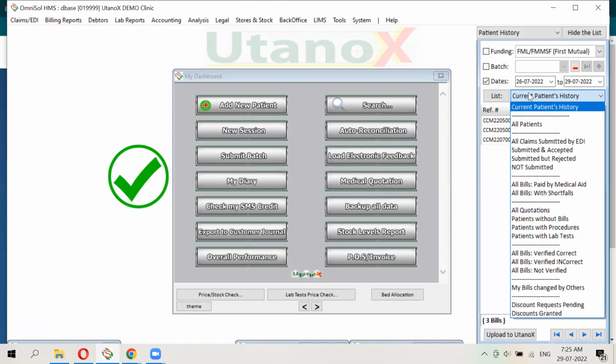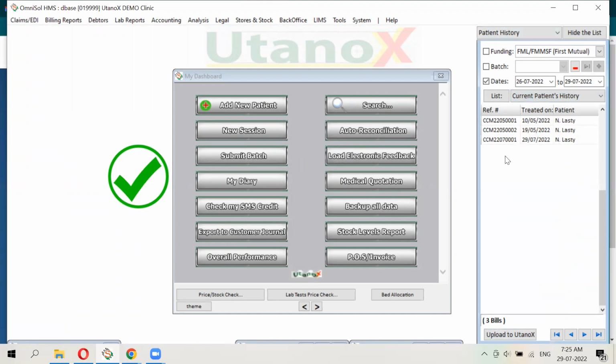And it gives us a summary of what has been submitted, right? Yes, there's actually a whole portal that takes care of EDI functions. There's actually an entire portal that takes care of EDI related reporting and keeping track of the traffic on EDI. Okay, they go as what, as XML files? This format is defined by the funder, by the receiving system. It's usually XML, yes, but some funders actually have different formats which are really unique to them. But the standard, yes, it's usually XML. Some have JSON.